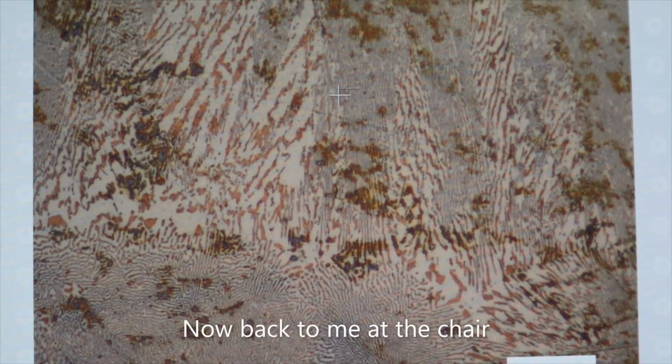So this would be a pretty good guess to say you can guess the composition of this sample, because we have very little pure alpha and pure beta, and we have almost entirely pure eutectic in our sample.